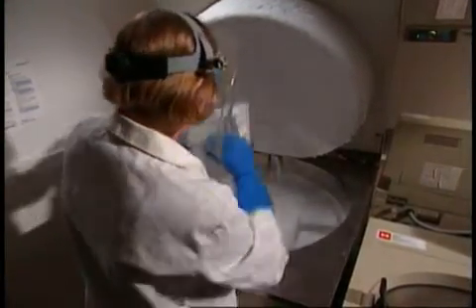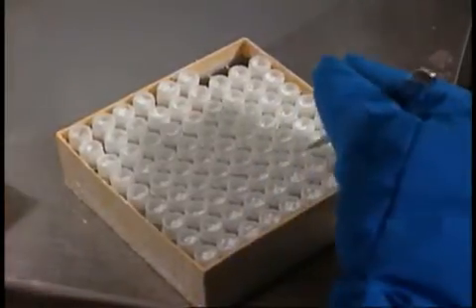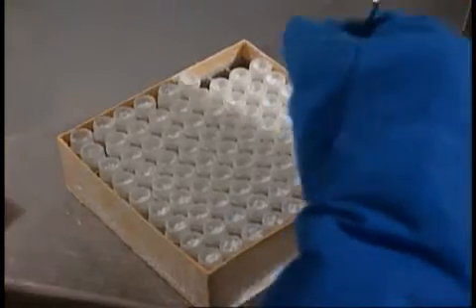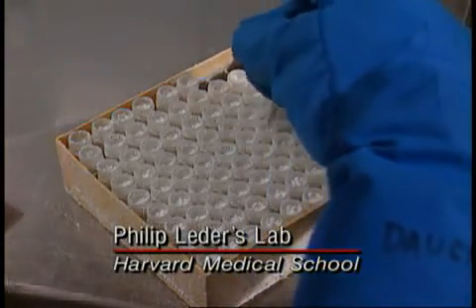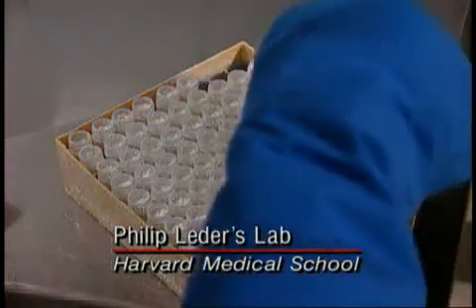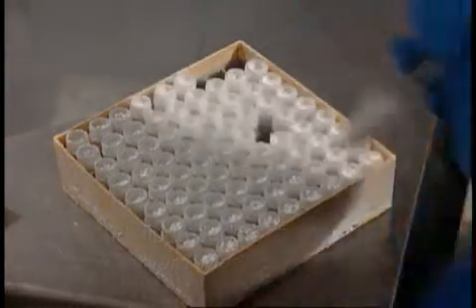Cathy Doherty is preparing to mince tumor tissue from a mouse. While this work does not require BSL-2, the practices for maintaining quality science and for safeguarding the worker are identical. Whatever the task in the mammalian cell culture lab, these are the principles that will serve both science and safety.